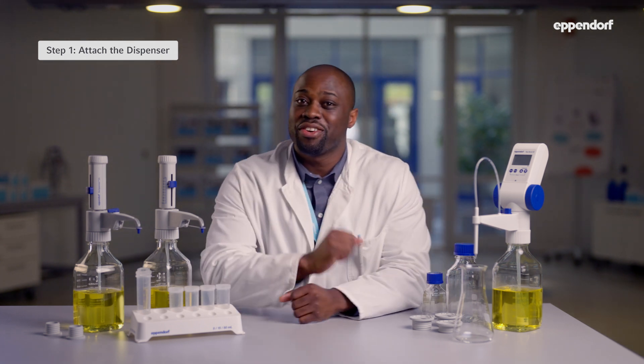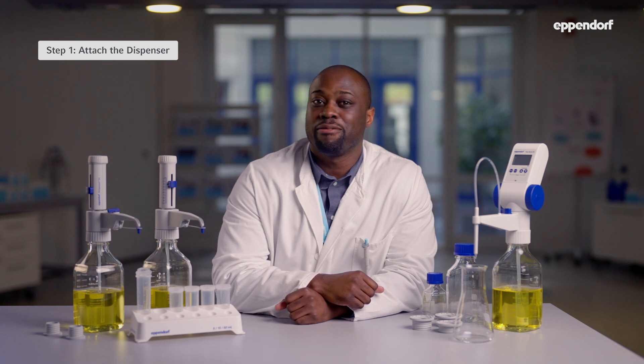Let's take a look at how to operate them in three steps. Step 1: Attach the dispenser. Adjust the telescopic aspiration tube to the bottle height and insert the top end into the aspiration valve. The lower end of the outer tube is cut at an angle — in this case, it's already done.